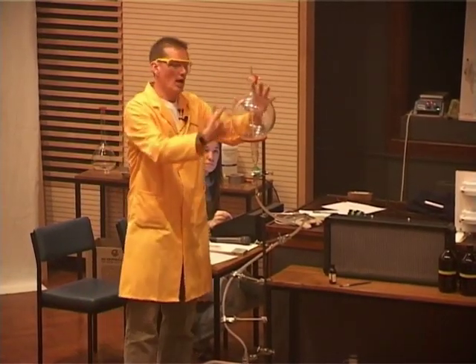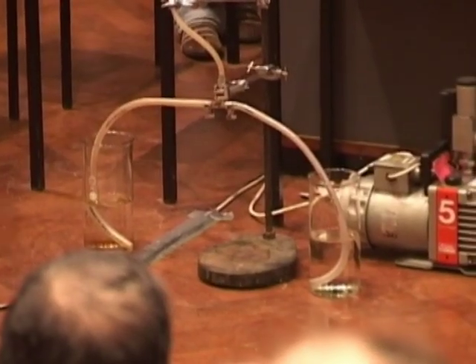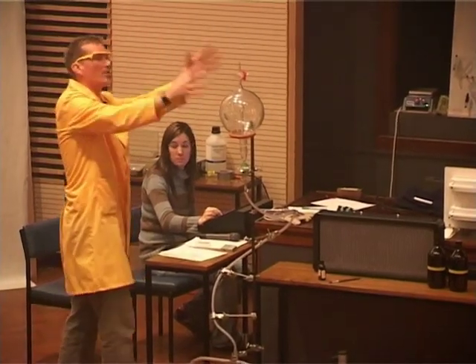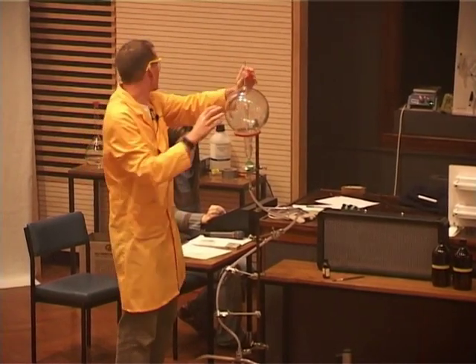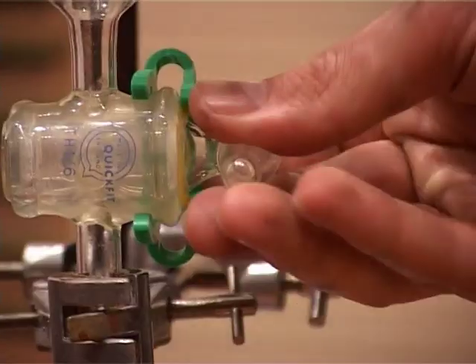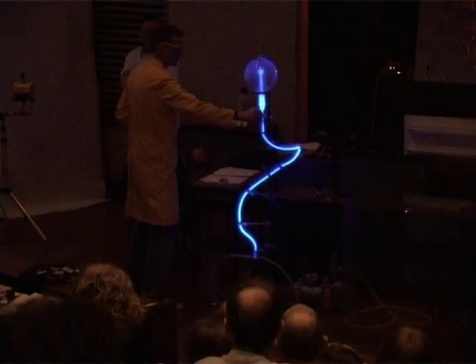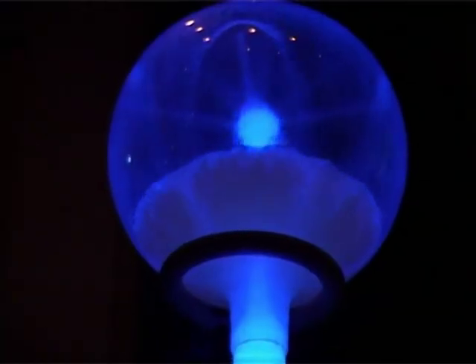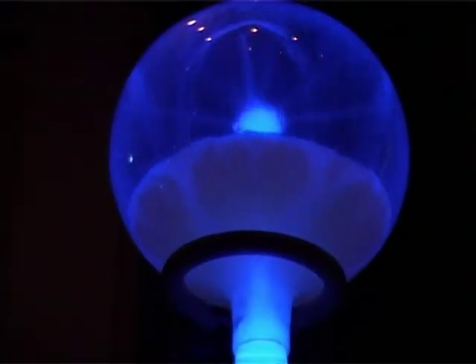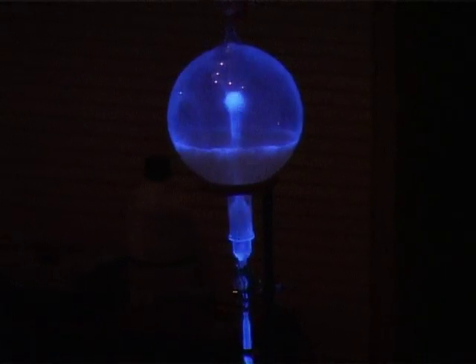Now they're going to move up into this flask here. This flask, we've taken all the air out of here, and the air is pushing down on the beakers here, and that forces the liquids up into the top flask. But when the two liquids mix, then we see the light. So if we have the lights down, please. There we are. So this is the reaction of a chemical called luminol as it's being oxidized, and to cause the oxidation here we're actually using some bleach.